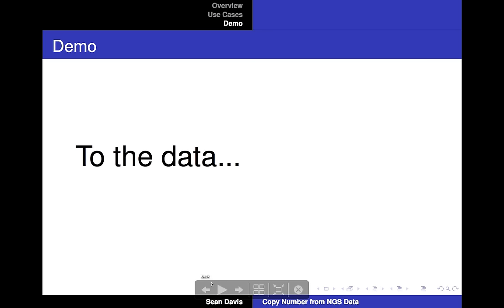We do have samples that show a high degree of duplication, probably due to low complexity DNA going in, so low quality DNA going in into the reaction. But that's one of the steps. That's the step that's most likely to help you clean up the copy number estimation. To answer the question directly about what mapper we use, we don't have a quote-unquote standard. We use BWA, Novo-Align, GSNAP, Bowtie 2, and ELAND, all of those in the lab.